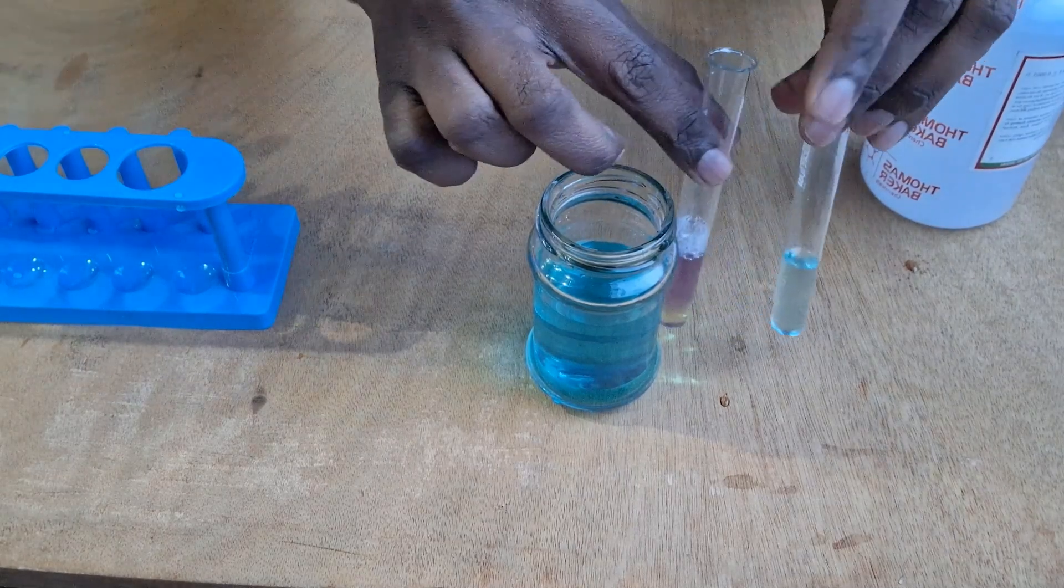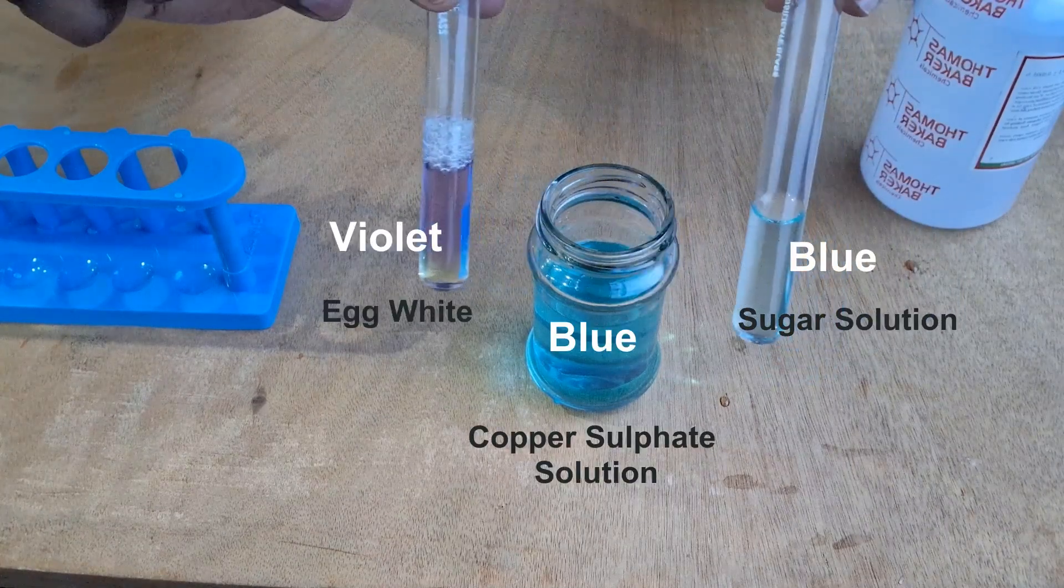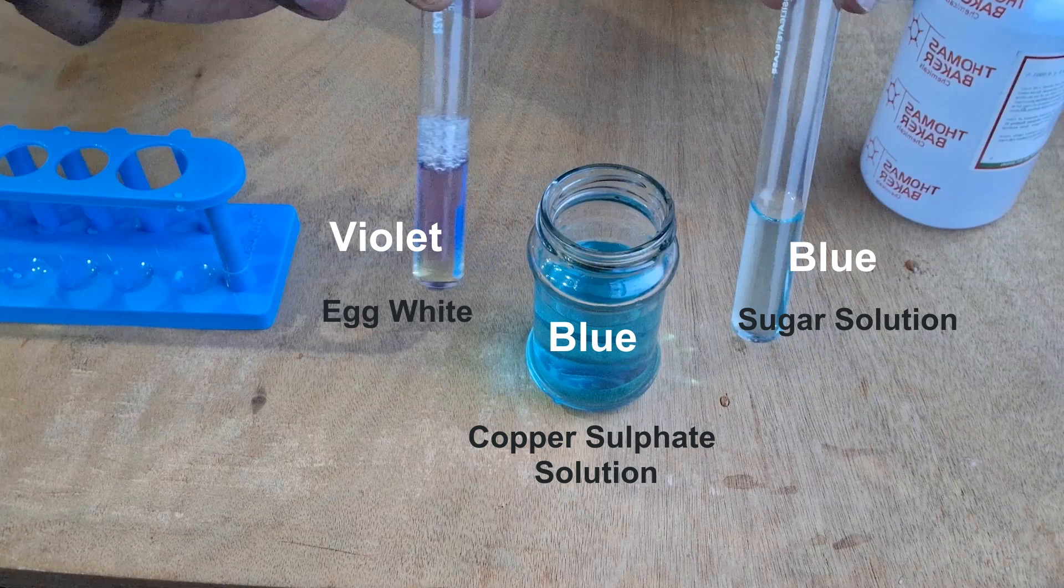You can compare all three solutions and check that there is no change in color in the case of the sugar solution. Let's pause for a moment and look at this: we have violet color with the egg white, and we have blue color with the sugar solution.